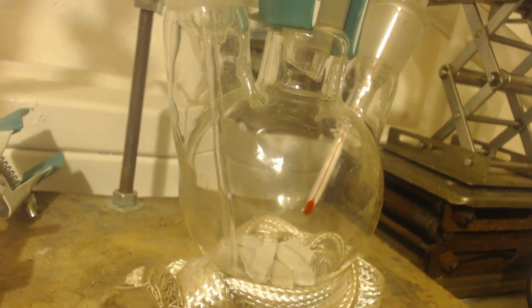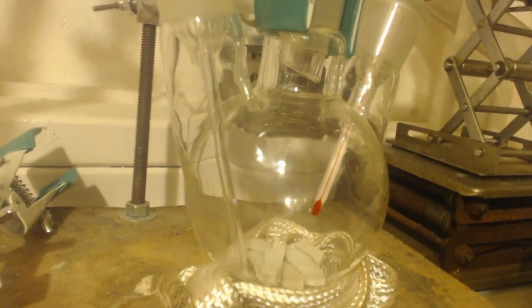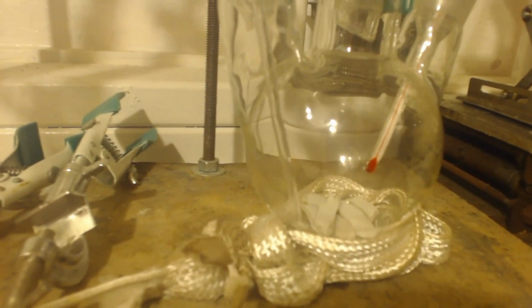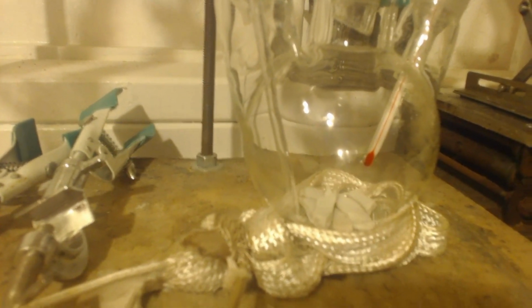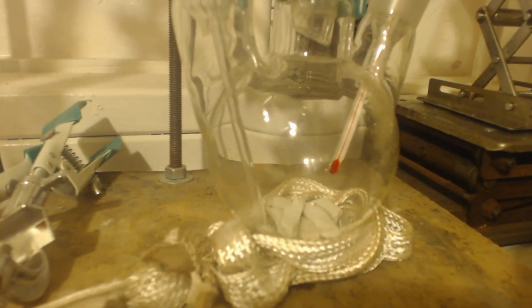The thermometer is because DCM boils at whatever. Let's just make up a number, 60 degrees Celsius. And tetrachloromethane boils at, like, say 90. So it's going to start out at the boiling point of DCM, whatever it is. And then when it gets up to the boiling point of the tetrachloromethane, I'll know that it's starting to work. You know what I mean?